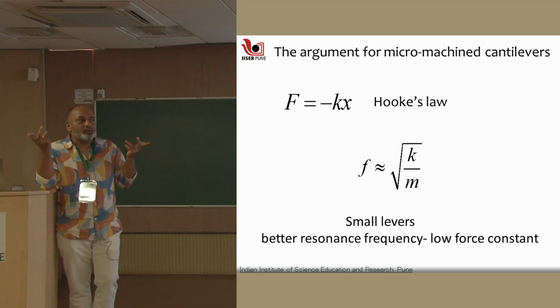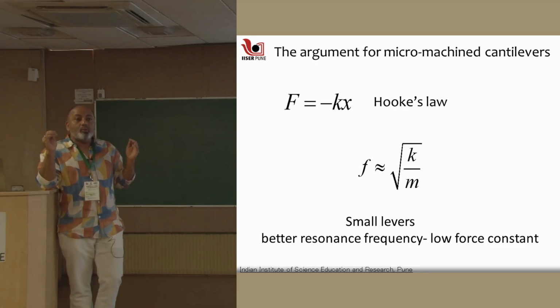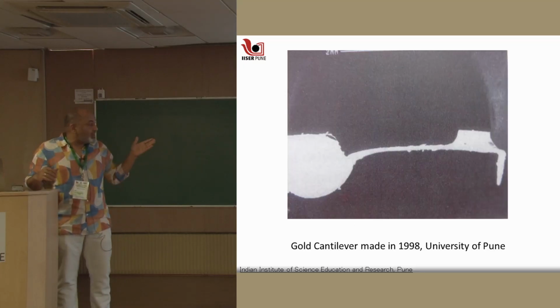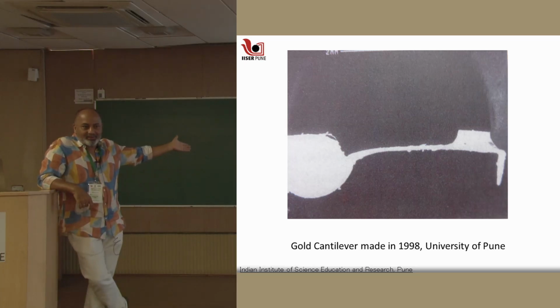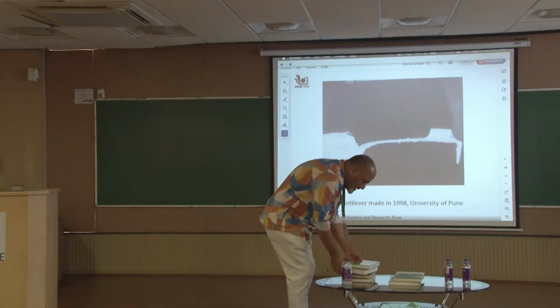Now this seems like a Newton per meter, but that's very weak. Because as we just said, the typical springs that one encounters in daily life are 6 to 7 orders more in stiffness. So I have to make a cantilever that's very weak, and if I look at this cantilever, how did I choose these dimensions? What was my logic behind choosing these dimensions? And the logic is simple.